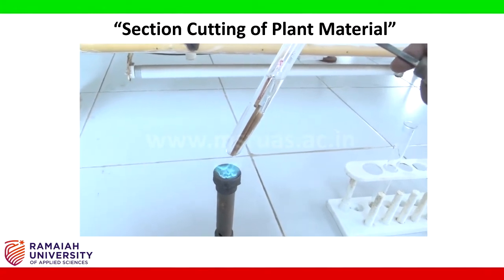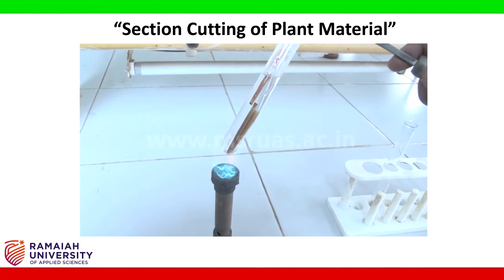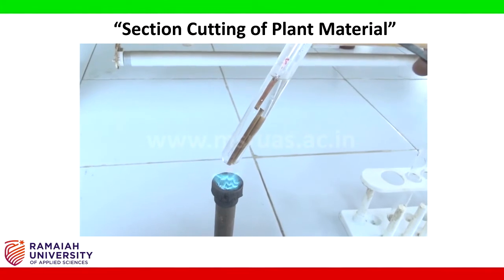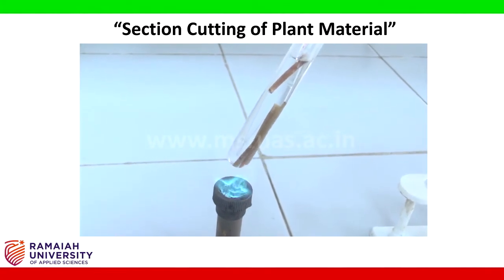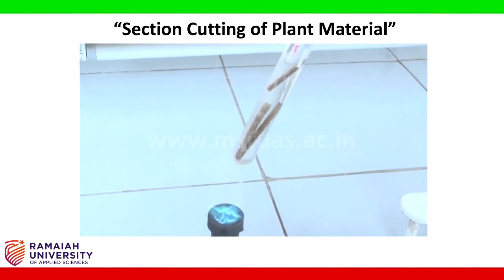The plant material should be boiled until it becomes softened. So it will take nearly 30 to 40 minutes. If it is a harder part of the plant like hard root, it will take more than 1 hour for softening. Now almost 1 hour is over.